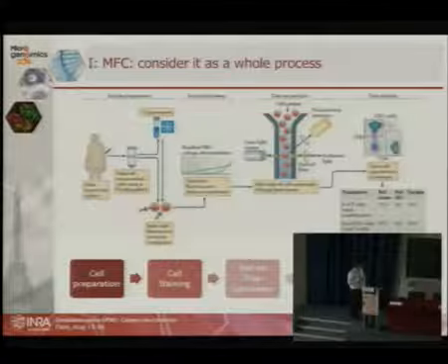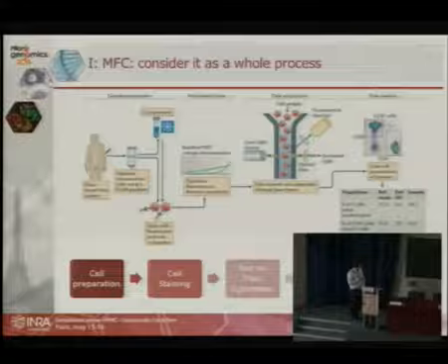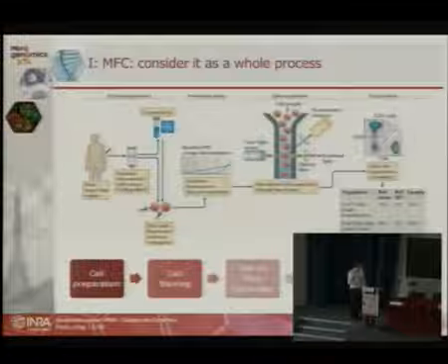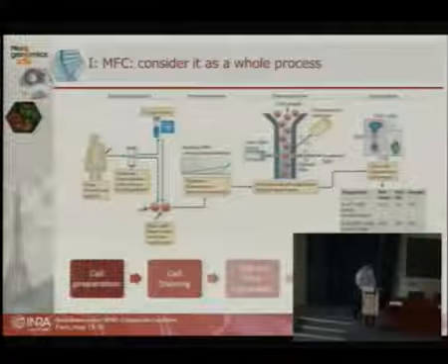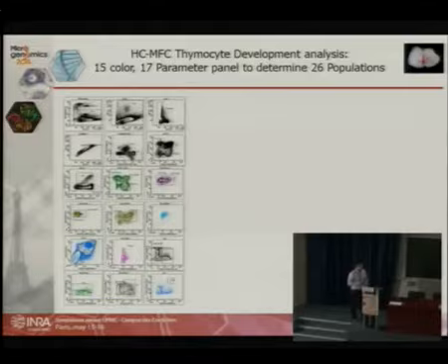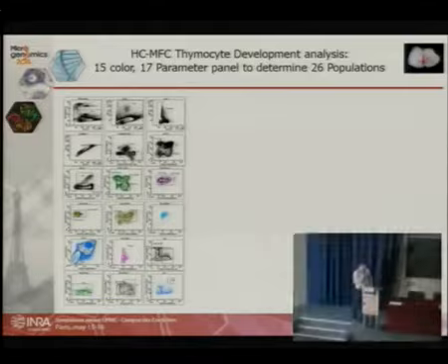So really, flow cytometry is all this. It's the cell preparation. You have to standardize this very much. The cell staining. You have to test what you do on the flow cytometer first to ensure that what you do is right. And then you have to go on the cell sorter, sort your cells very, very quickly and extract DNA and RNA.